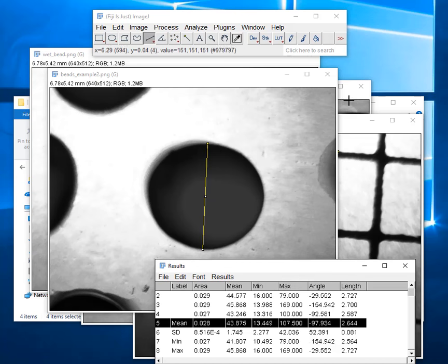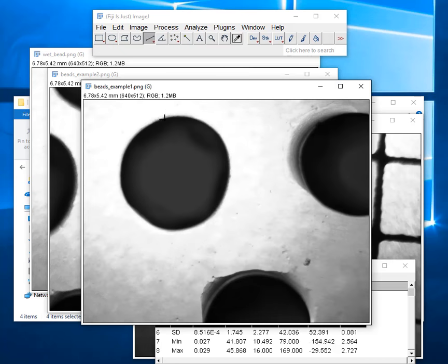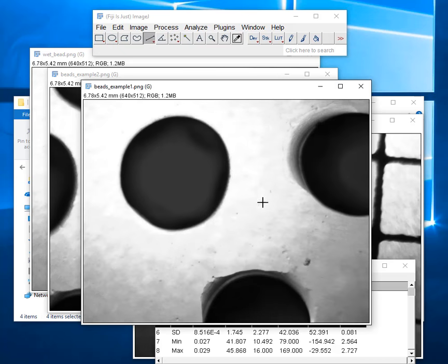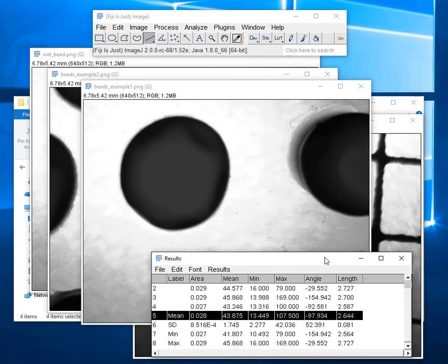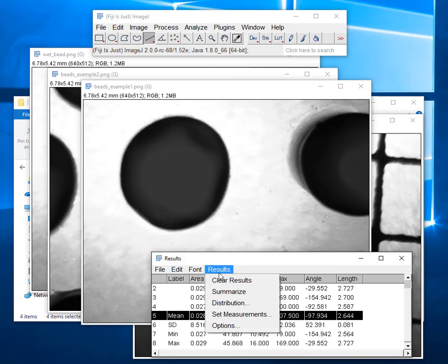And that gives us one bead. And so what we do next is we go to another bead. I have another picture and I make another measurement. And we go to another bead. And we keep repeating until we have several beads measured. And that will give us a good idea of the average of all the beads in our group.